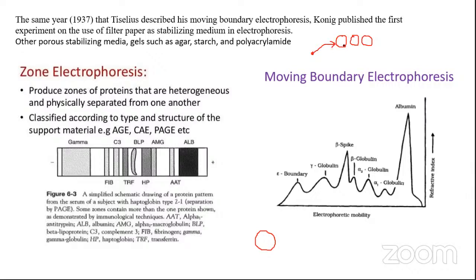They become slightly bigger balls or beads of gel. So these are referred to as the gel beads, which are used for chromatography. You don't use gels in the form of beads for electrophoresis. In electrophoresis, once you cast the gel, it forms a meshwork-like structure.